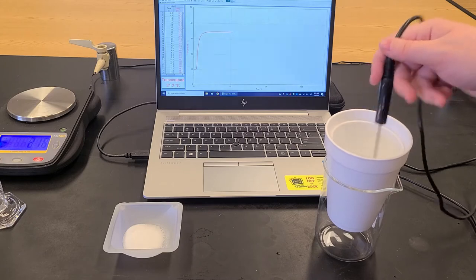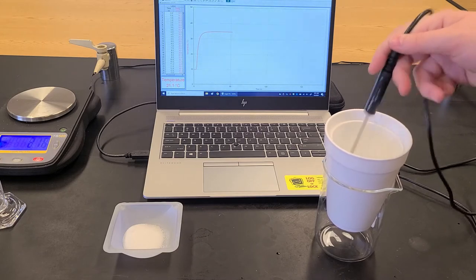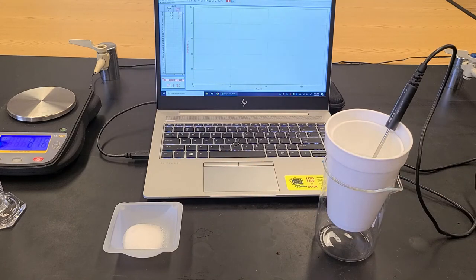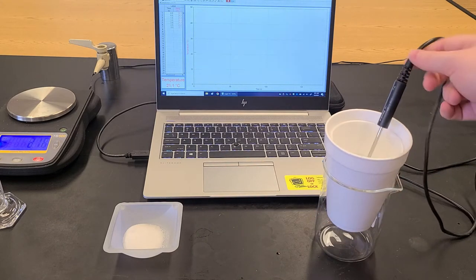So just stirring, making sure everything's come to the same temperature there and start collecting data. So we can see what our starting temperature of the water is.